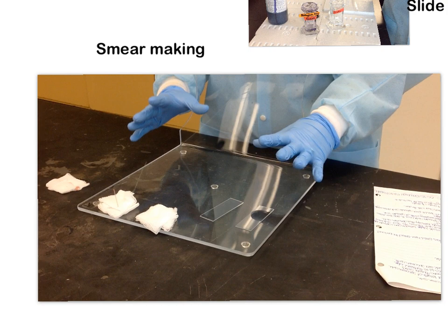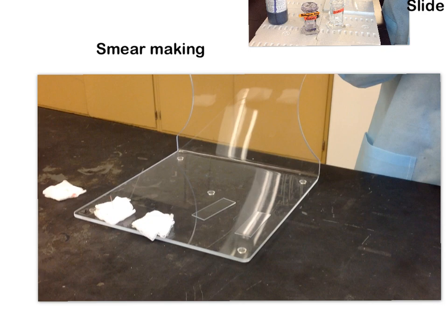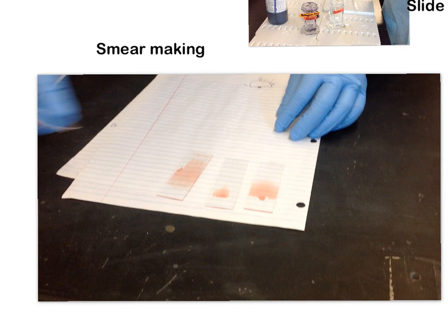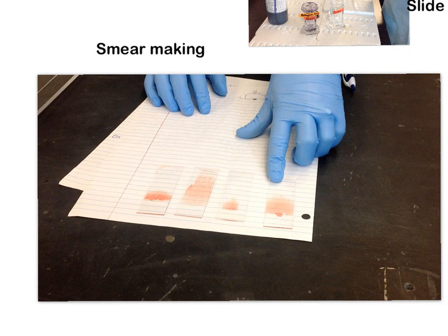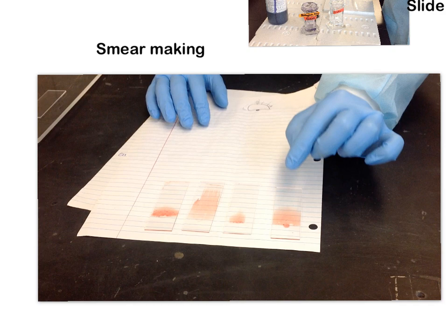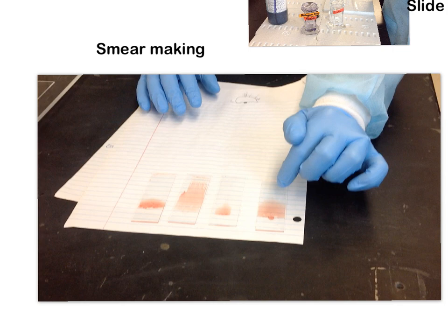Let's go through some examples. Looking at these smears on a white backdrop — this smear right here is a good smear. You can see a flat back line and a nice rounded edge at the top, which we call the feathered edge. I'll explain why the feathered edge is so important shortly. This is really the ultimate goal of what you're shooting for when you make your smears.